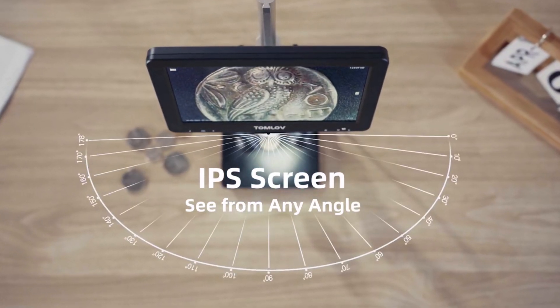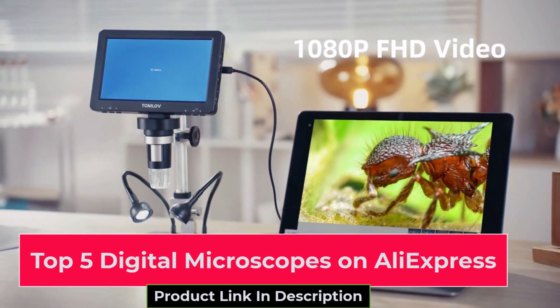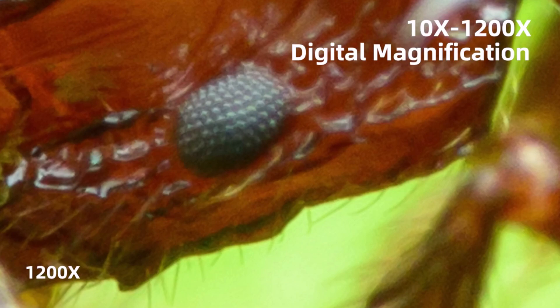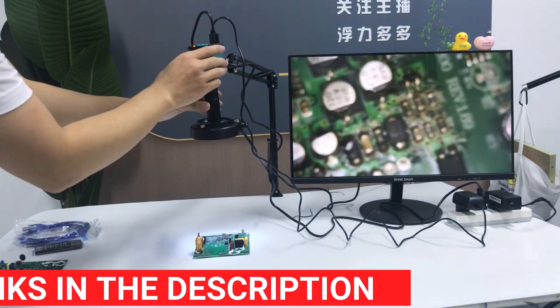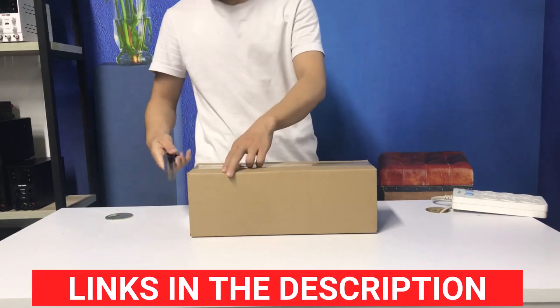In today's video, we'll be reviewing the top five digital microscopes on AliExpress, offering the best features and value for your money. Whether you're into electronics, biology, or crafting, these microscopes provide excellent magnification and clarity. For more information and to place an order, please check the description below or the link in the first comment.